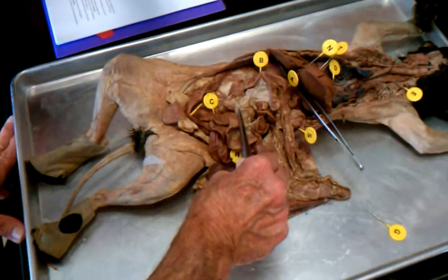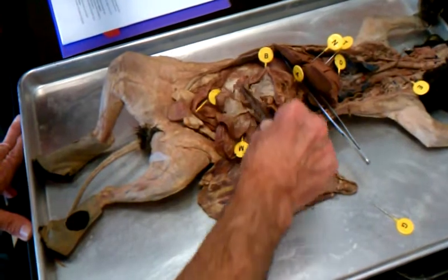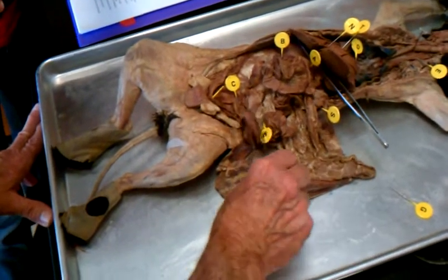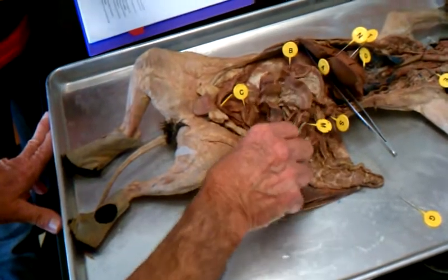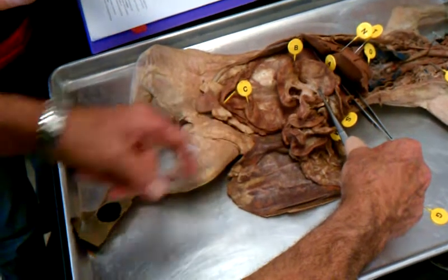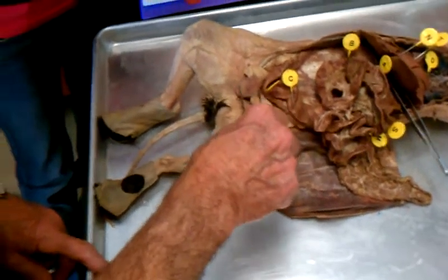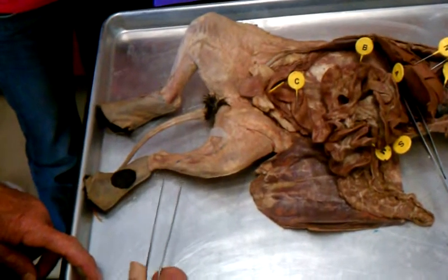So that would be pin M. You see there, M. It's in that mesentery. So if I move the small intestine out of the way, you can see a larger tube back at the back, and that's the large intestine. So I put the C pin in the colon. And then as the colon disappears down in the pelvic cavity, you can see that I put the pin R there to show where the rectum might be. And those are the parts that we want to be aware of.